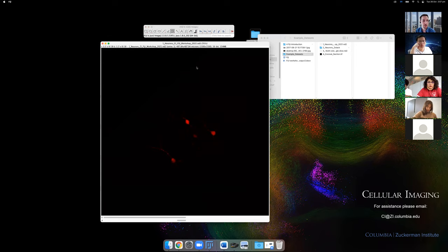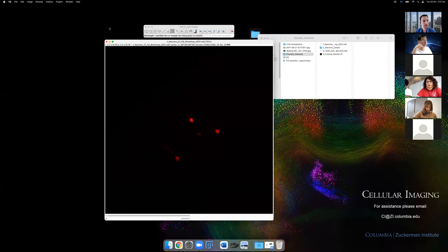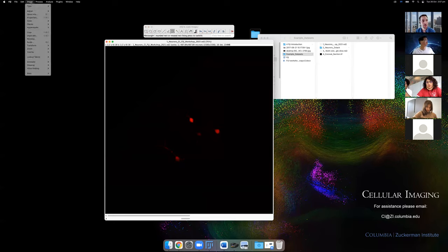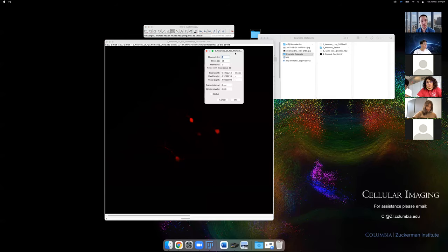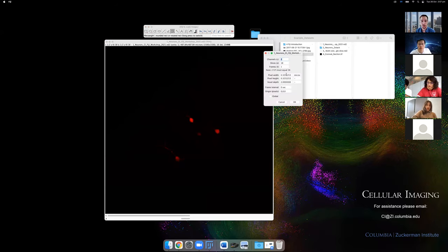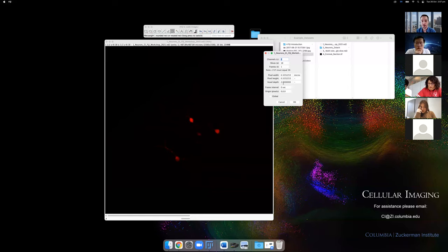Whenever you're working with images in ImageJ, it's really important to check the image properties if you're going to do anything quantitative. Go into Properties and check straight away if you're getting something sensible in pixel width, height, and depth. I can't count how many times this has been the cause of a problem — if the dimensions got lost, any area or volume measurements will be completely inaccurate.